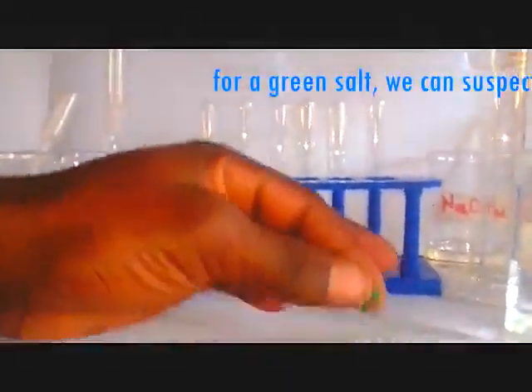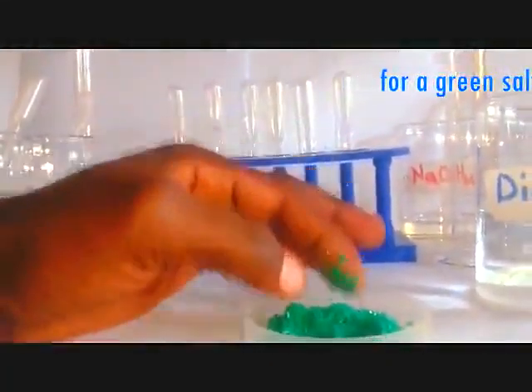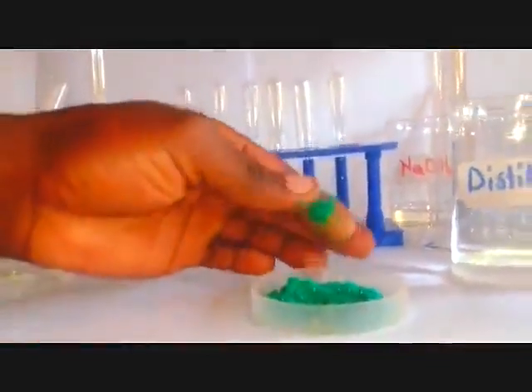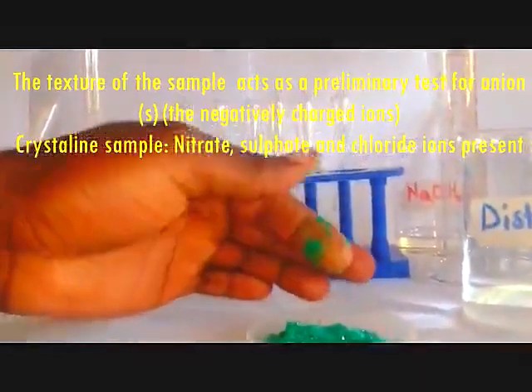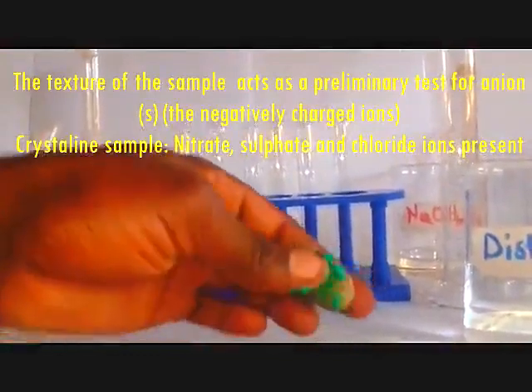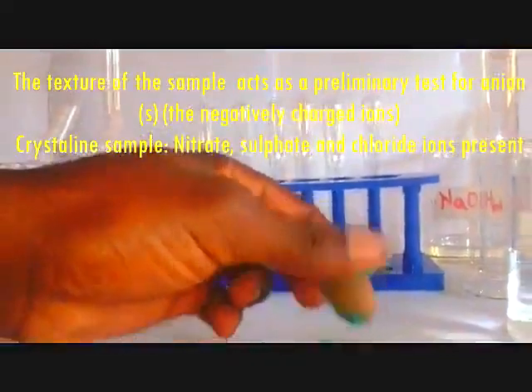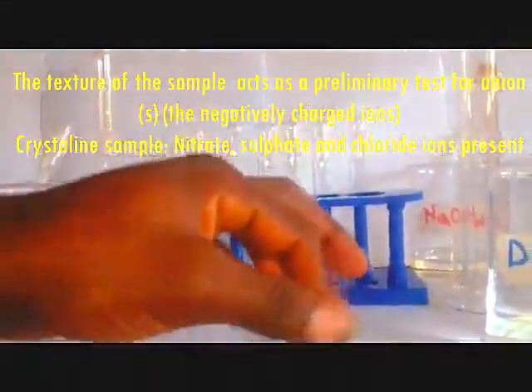So after seeing the color, we are going to deal with the colored cation or cations. Then you need to feel the texture. If you try to feel the texture, it is crystalline. And being crystalline, we can suspect either a sulfate or a chloride, as you can see here. Now, in this practical, we are not going to involve heating.